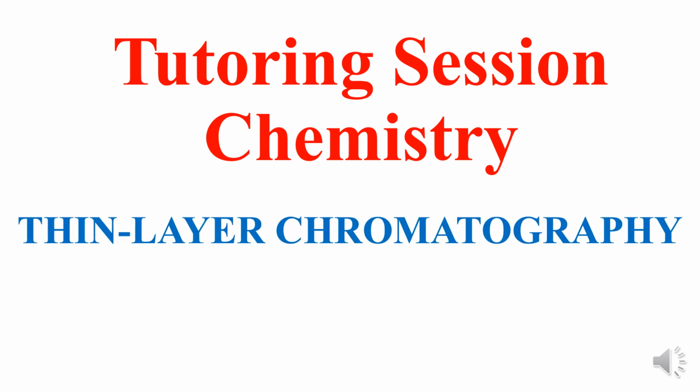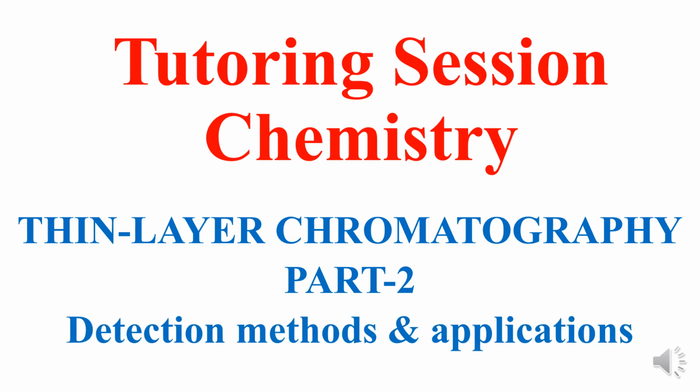In this video, I'll talk about thin layer chromatography. The current video is part 2 in the thin layer chromatography series, and I'll explain the various detection methods commonly employed in the thin layer chromatographic separation method and the applications of TLC.